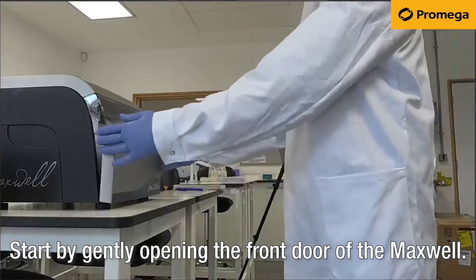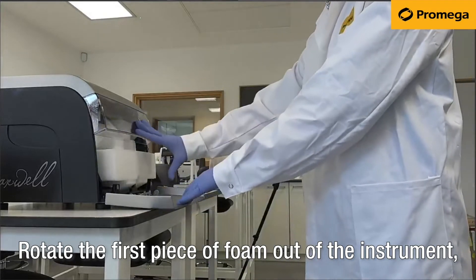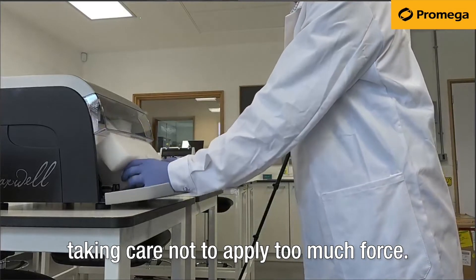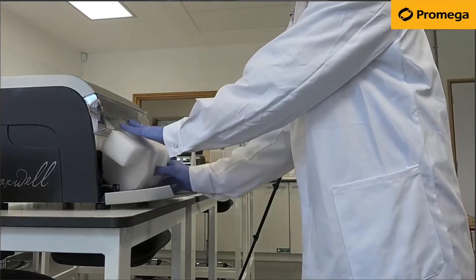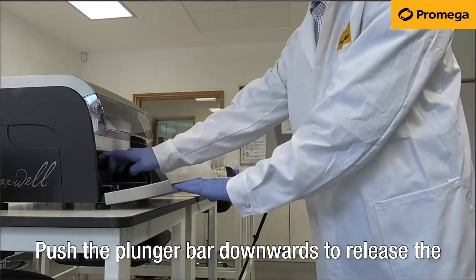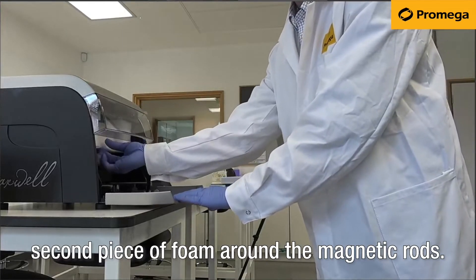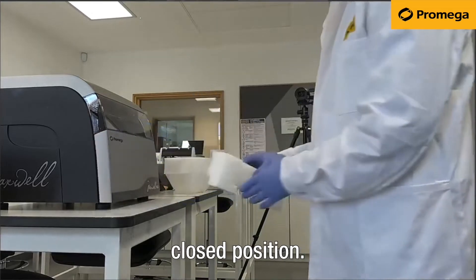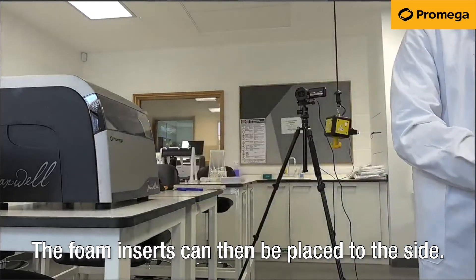Start by gently opening the front door of the Maxwell. Rotate the first piece of foam out of the instrument, taking care not to apply too much force. Push the plunger bar downwards to release the second piece of foam around the magnetic rods. Slide this foam out and return the door to its closed position. The foam inserts can then be placed to the side.